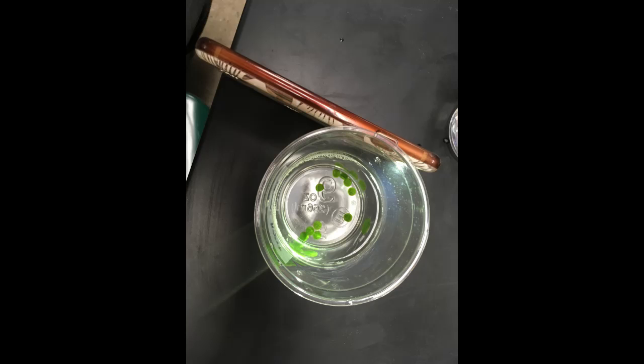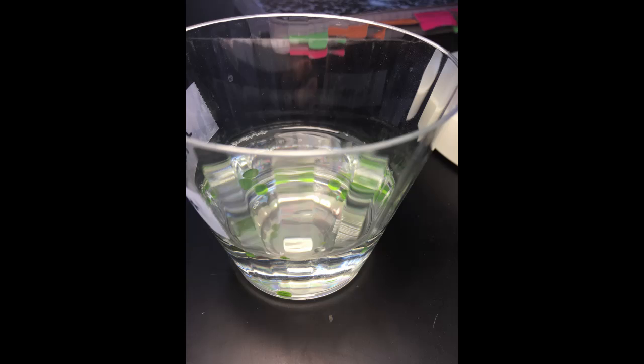So the design of our experiment was basically we had the same procedure as the previous one. So we would hole punch the spinach, and we would take 10 sections per light. So we would have 40 hole punches in total, spread out over 4 groups, one being the control. And then we would suction the spinach sections inside the syringe, which would seal it with the sodium bicarbonate with soap. So that would create a suction around it, and that would trap the O2 as it's being produced when we were experimenting.